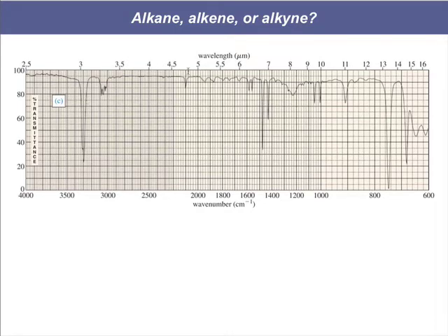We've also got a little peak at around 2200. That's got to be our carbon-carbon triple bond. The fact that we've basically got no alkane signals at 3000 makes me think that this is acetylene. This is C triple bond C with two hydrogens on it, which have no sp3 carbon hydrogens and no sp3 carbon-carbons. So that's kind of a weird spectrum, but we do have our conspicuous alkyne carbon-carbon triple bond and sp hybridized carbon hydrogen bond.